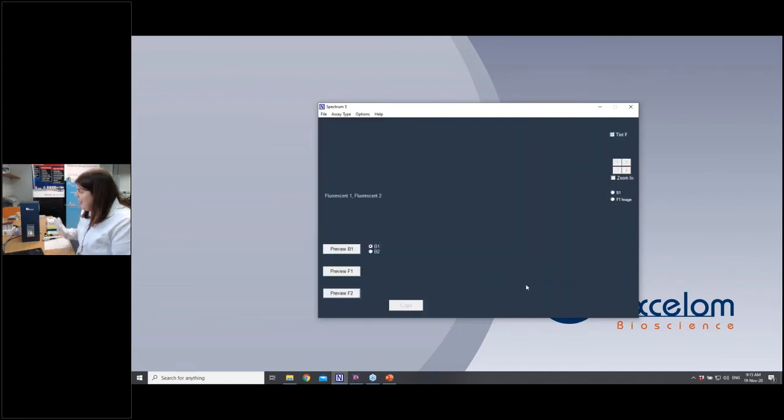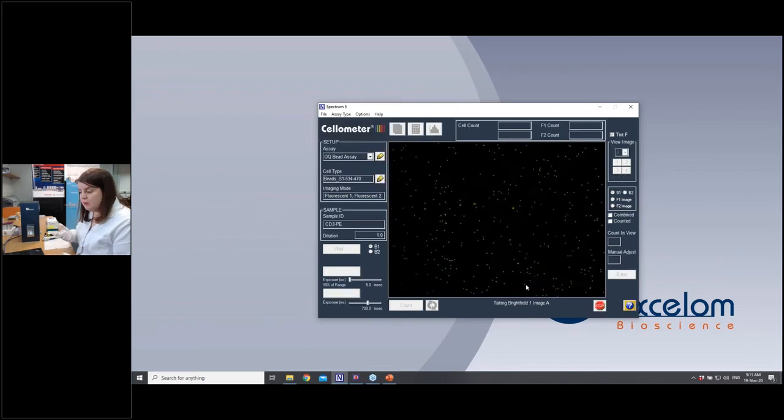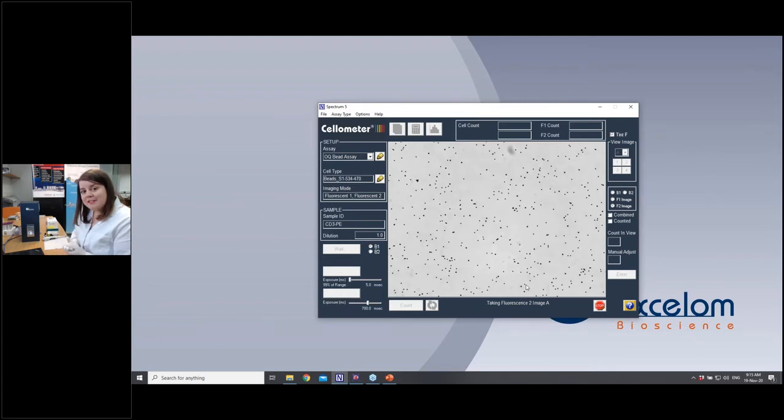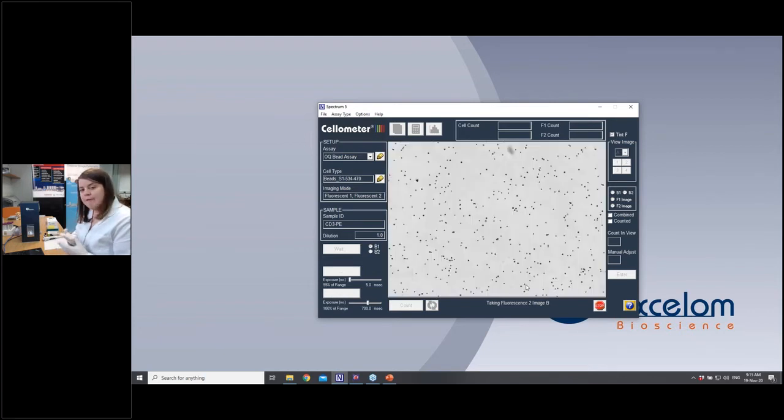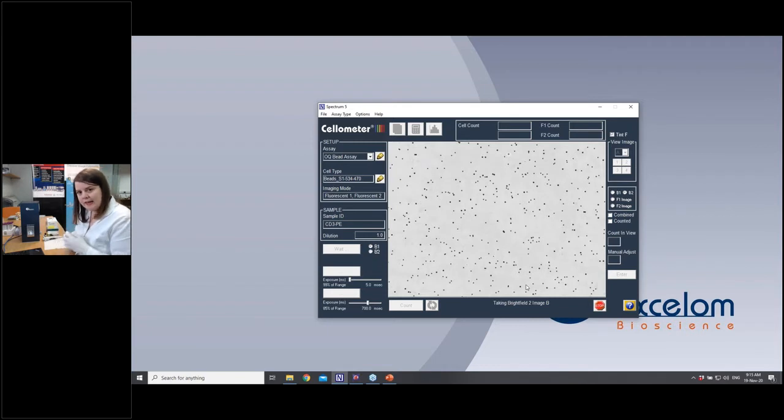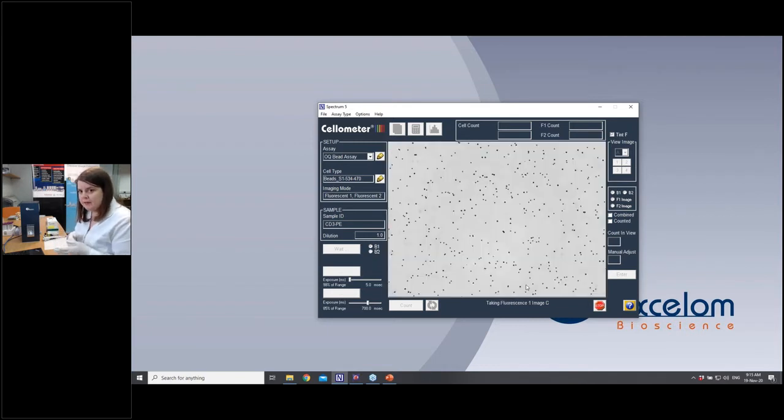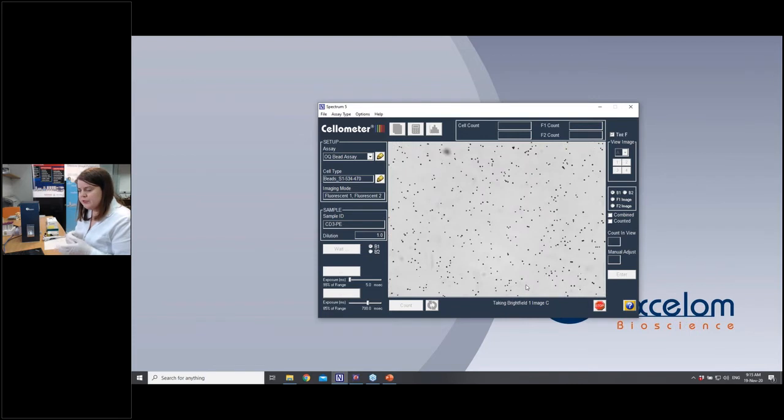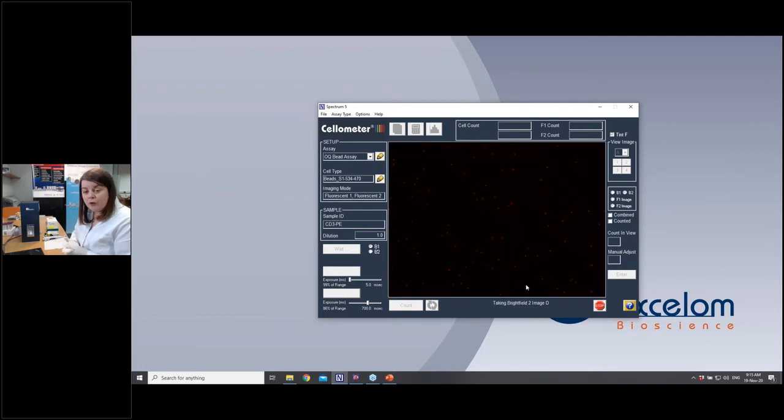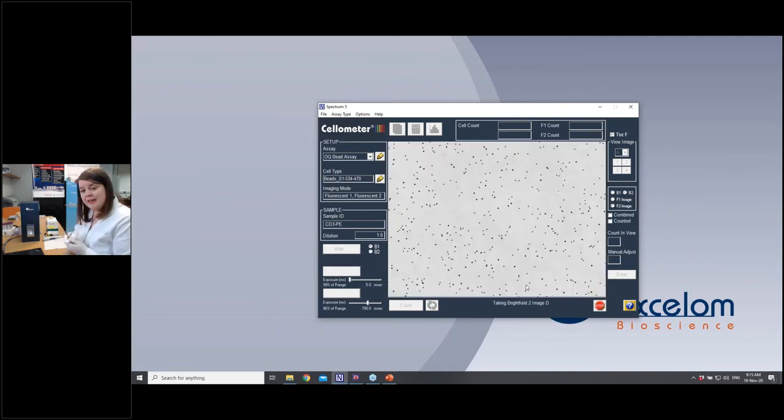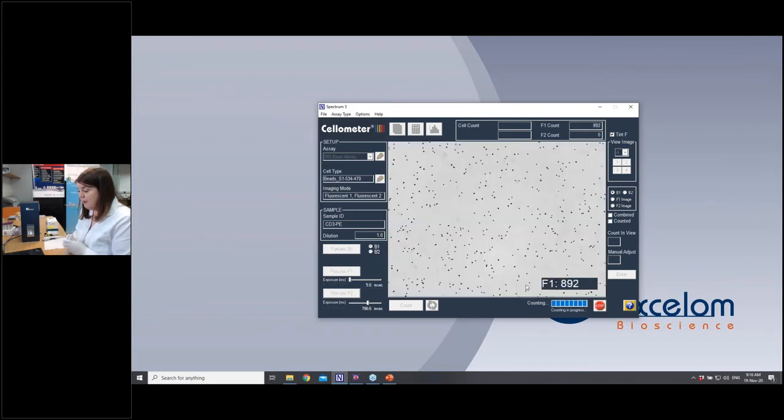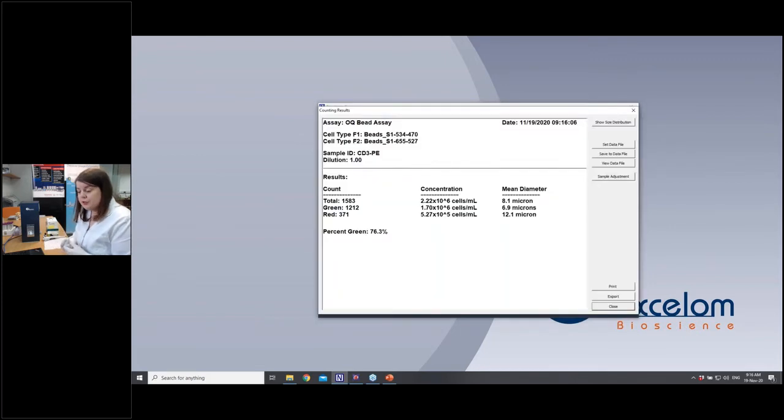So you'll hear the filters moving at the moment. What the Spectrum is now doing is it's taking four areas of images. It's similar to counting the four corners of a hemocytometer, but it's actually a larger area than those four corners. So you'll be counting more cells than you would on a hemocytometer. So it's taking four different areas, taking an image in brightfield and then it's taking an image in the green channel and then in the red channel. It'll add all of those up at the end. You should see it counting them and then your results should pop up.